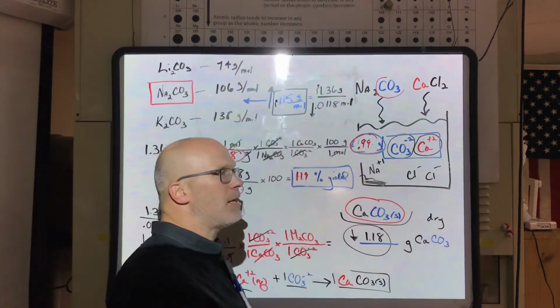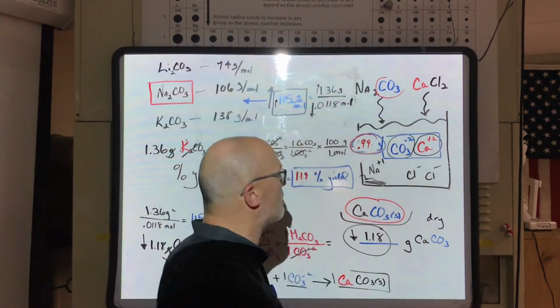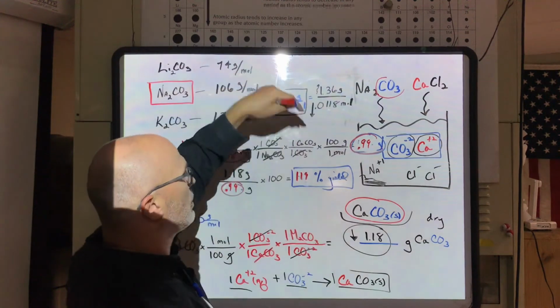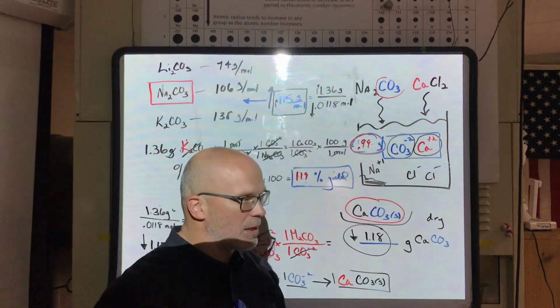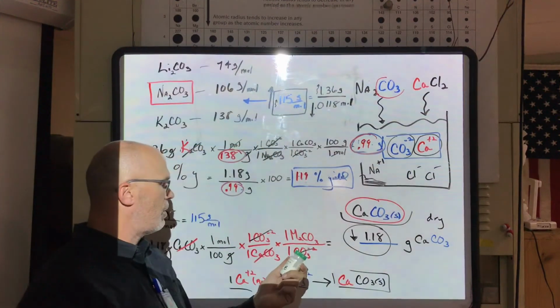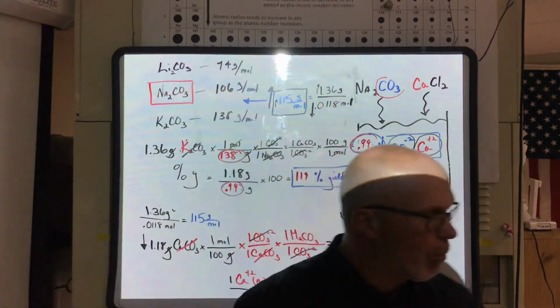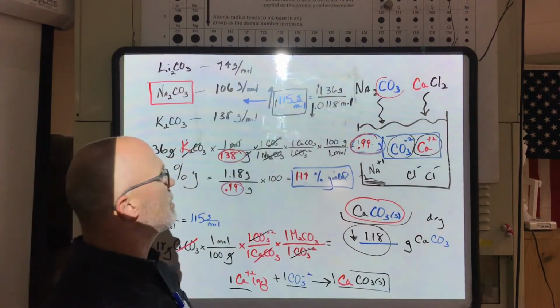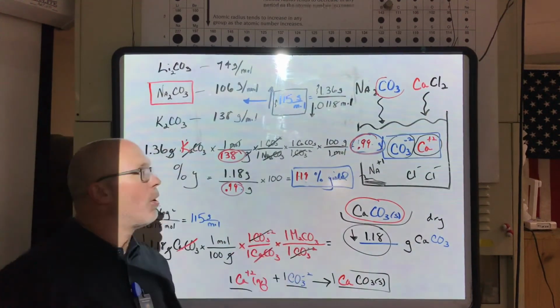Now, what if it is a chemical that does precipitate with the calcium? Well, then it would bring it down a little bit. But I'm telling you that these things are assayed right around 99%. So these things are pretty pure. So at 99%, those errors are small and minuscule, but they can go either way. We don't know for sure.